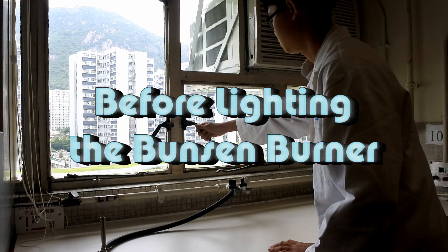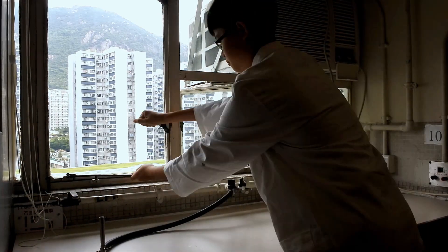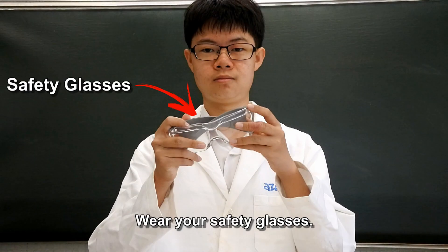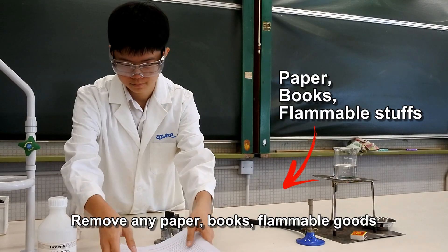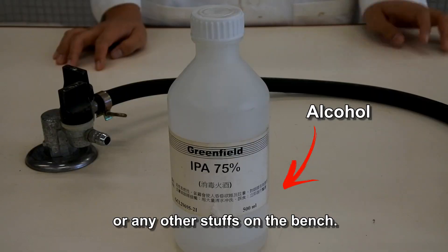Before lighting the Bunsen burner, open the windows. Wear your safety glasses. Remove any paper, books, flammable goods, and any other items on your bench.